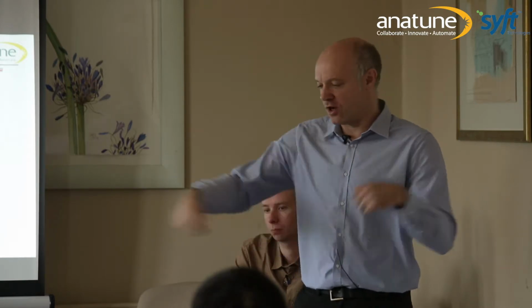Run your blanks without the analyte, and then really dig into what is happening in the matrix, because the one thing we don't get with SIFT-MS is separation in time. So if you've got conflicting stuff in there, you have to work hard at finding it. You can't just pull it apart on a chromatogram and say, look, there's the peak.